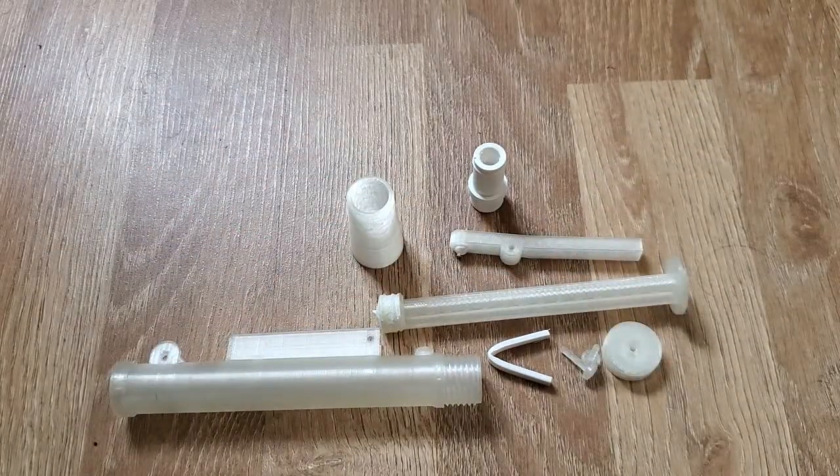And that's it — that's my 3D printed serological pipette. Hopefully with future versions I'll get it working and actually able to hold the vacuum that it creates. At the moment it can draw up the liquid, but it just doesn't hold the vacuum properly.